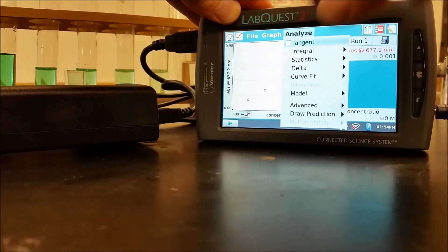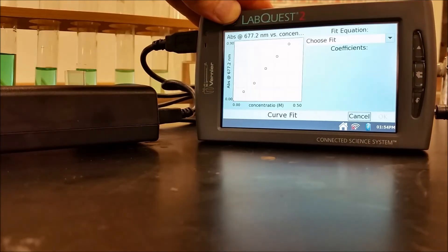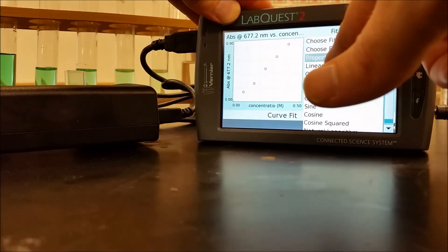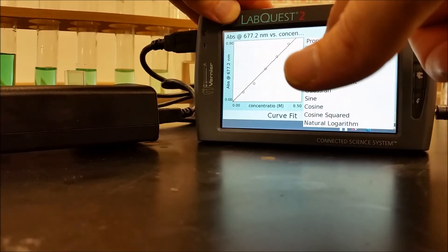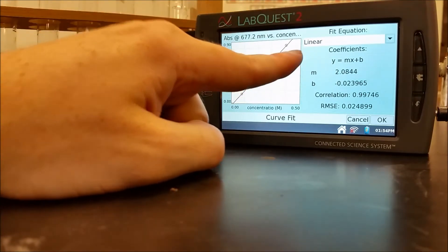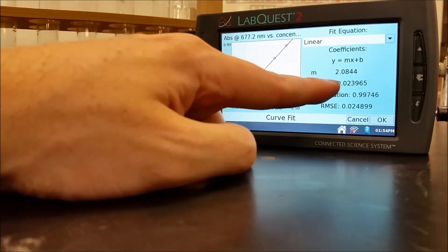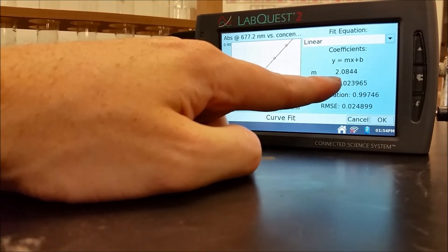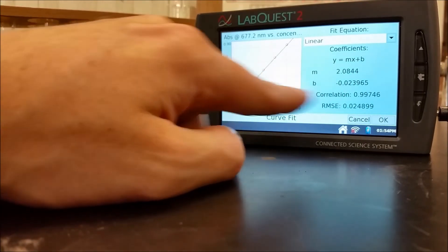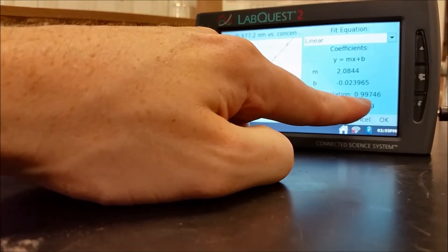And we want to put a curve fit on. Curve fit, we're going to select our curve. And then for the type, we want linear. Could also do proportional, I suppose. So this is giving me the y equals mx plus b for this particular plot. And you can see I have a little bit of error here on this point. It's a little too low. But other than that, I'm getting a slope of 2.0844 and intercepts just below zero, which makes pretty good sense. It should be zero, but close enough. And then here's my correlation 0.99746.